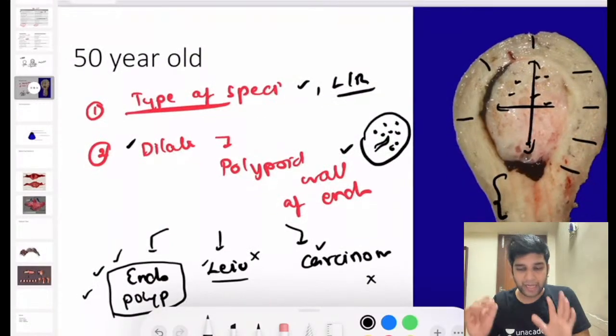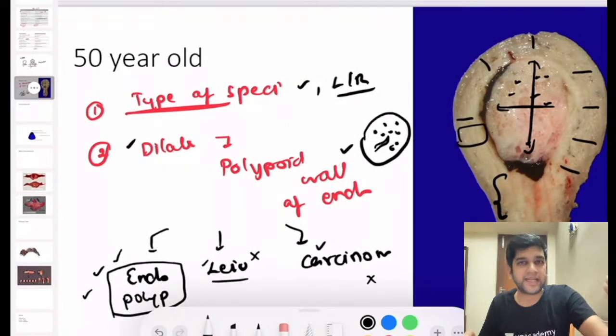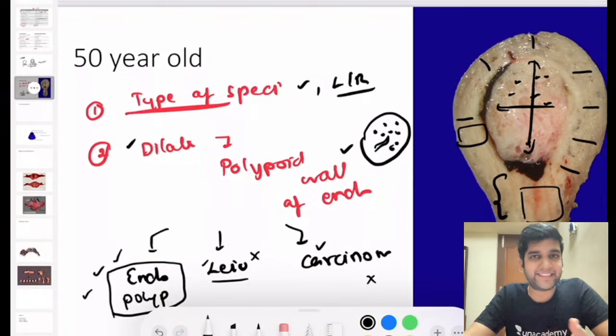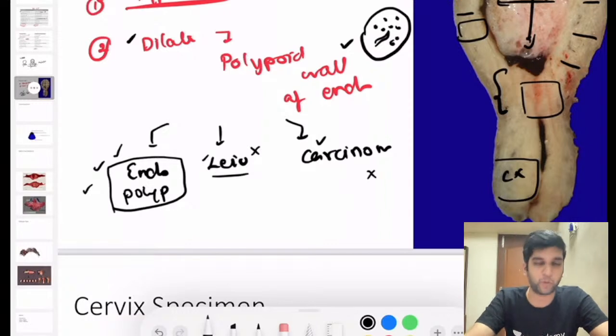The next thing, I also need to give a bit from a normal myometrium. If it has something tiny like leiomyomas, give from that. I need to give from cervix. I need to give from the isthmic part. Right? These are just to complete it, because I cannot ignore them since it's a hysterectomy done. We have to give a comment on the cervix, endometrial part, and the polypal part as well. That's how you cross an endometrial polyp.